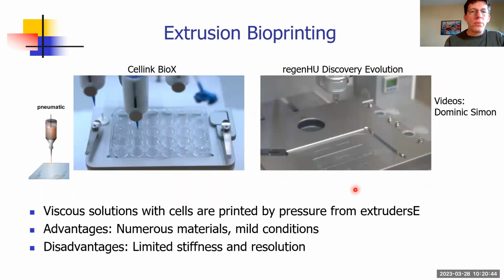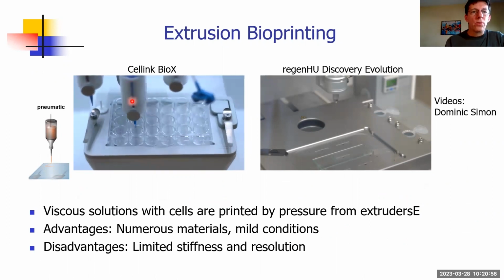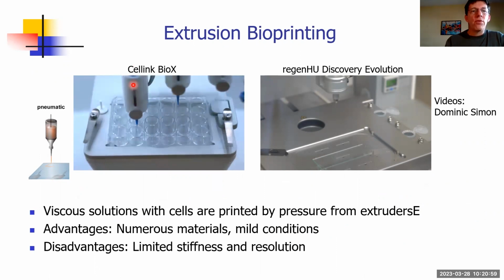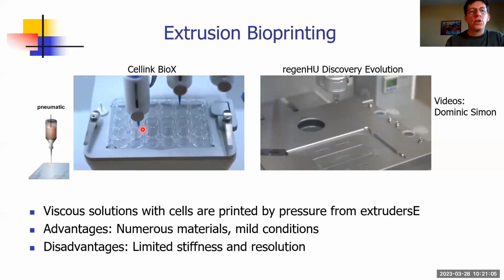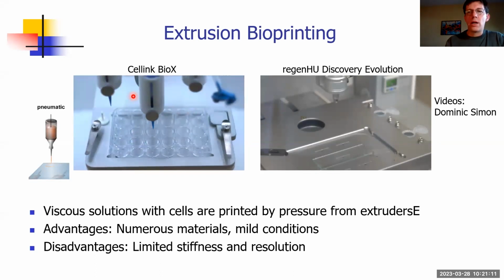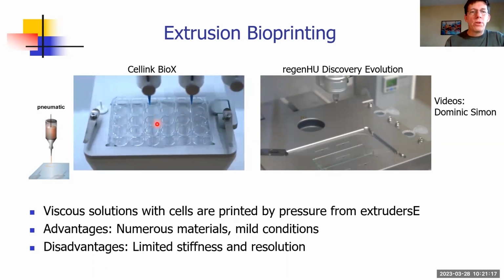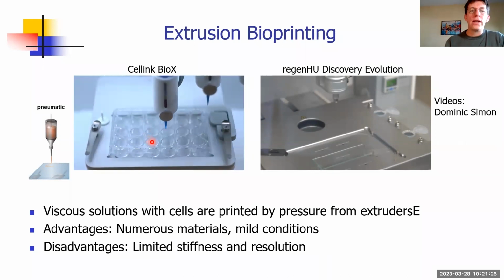So, to not be too theoretical, I brought two little movies of our bioprinters. One is the CELLINK BioX printer, and here we have the cartridge with our bioink and the cells, and we have a pneumatic extrusion. So there is air pressure on this cartridge, and then we produce our three-dimensional model. What you can see here is that we have two cartridges with two different materials, and obviously there are more positions available. This, for example, just printed a little cancer, and now comes the second cartridge that produces healthy tissue surrounding the cancer.